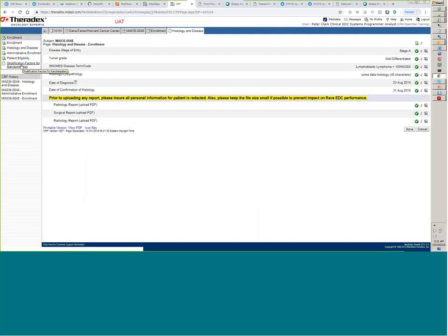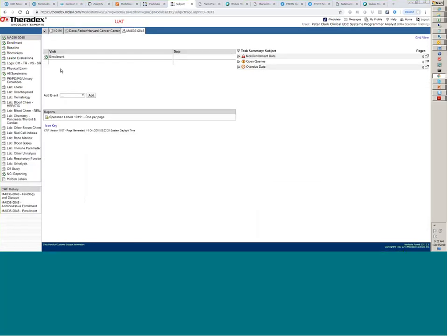There is randomization in this protocol, and IWRS is also the application that handles that. So you can inspect the stratification factors for the randomization in this form. That's not critical for the specimen tracking, so we're not going to look at it right now in this call. Going back to the patient level, you can see there's an all specimens folder, and it's got some data in it already. That was a derivation coming from the enrollment, coming specifically from that histology and disease form.